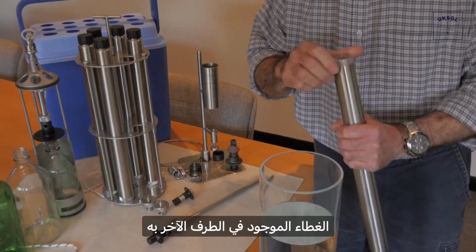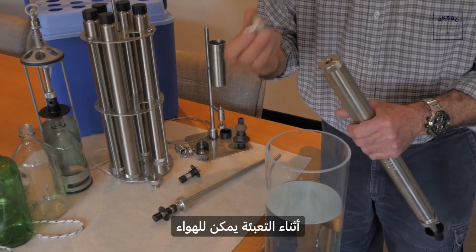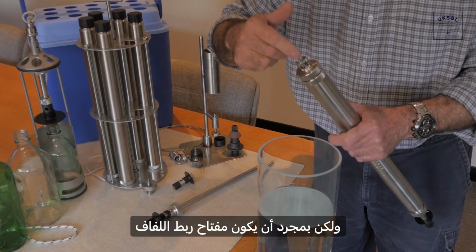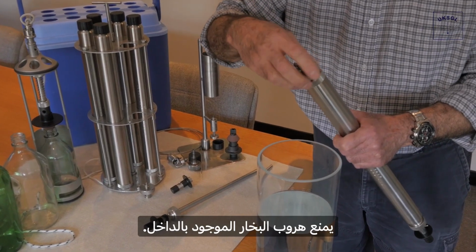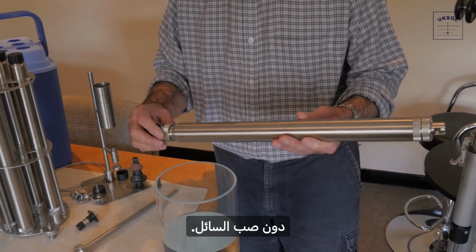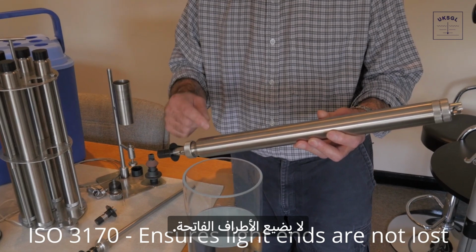The cap at the other end has a non-return self-sealing valve. During filling, the air can escape through this valve. But once the winder attachment key is removed after sampling, the valve prevents the vapor inside escaping. The whole tube, with its sealed contents, can then go to the lab for analysis, without the liquid being decanted. This is in strict accordance with ISO 3170, and ensures the light ends are not lost.